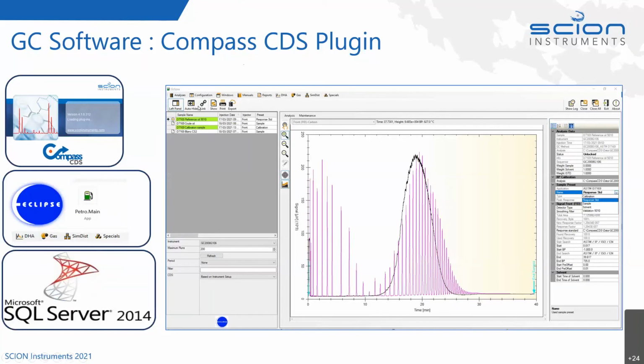So you can see here on the main screen, a screen grab from the Eclipse Petri reporting tool. You have an analysis here on the left-hand side. We have a chromatogram in the middle. This is for the FID response standard and the validation sample. And in pink, we have overlaid the alkane retention time versus boiling point calibration chromatogram samples. You can see here, and on the right-hand side, we can see the presets and the sample itself. So that is a screen grab of the Eclipse software itself.